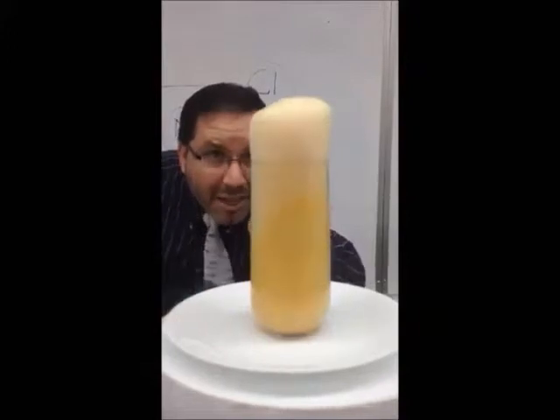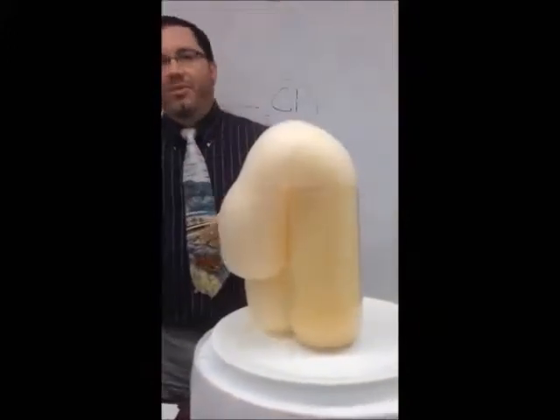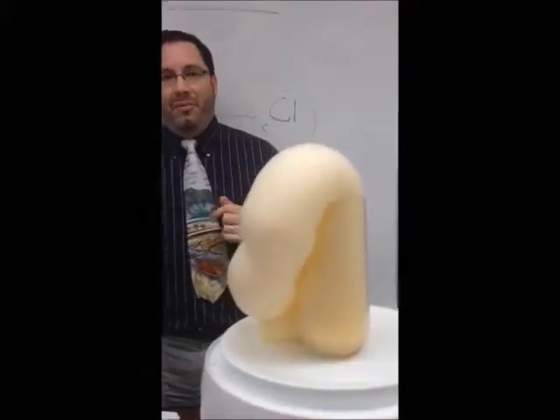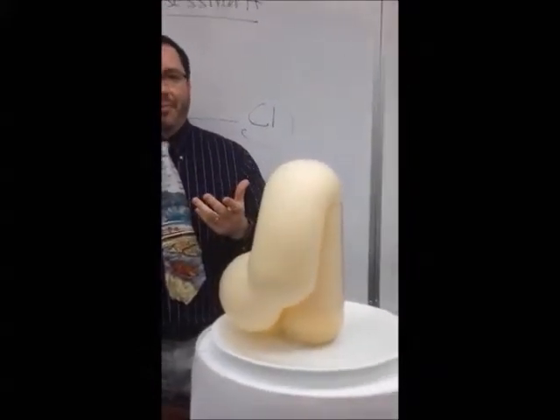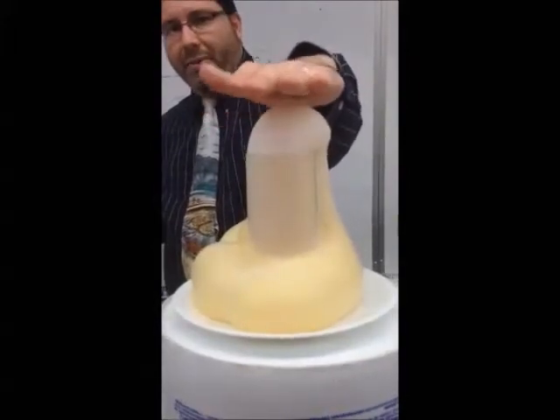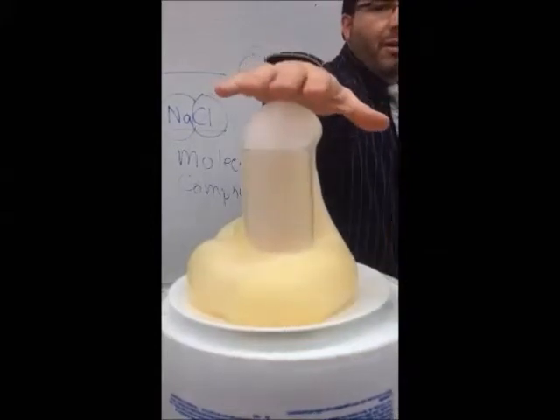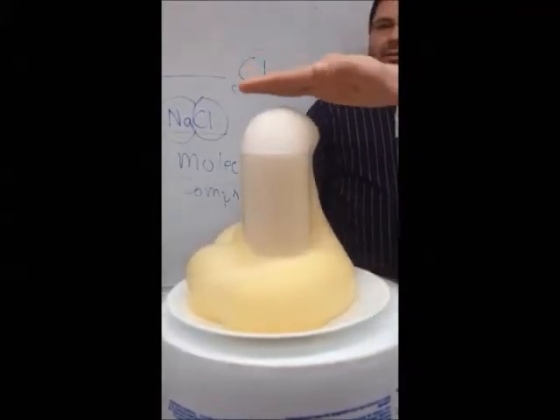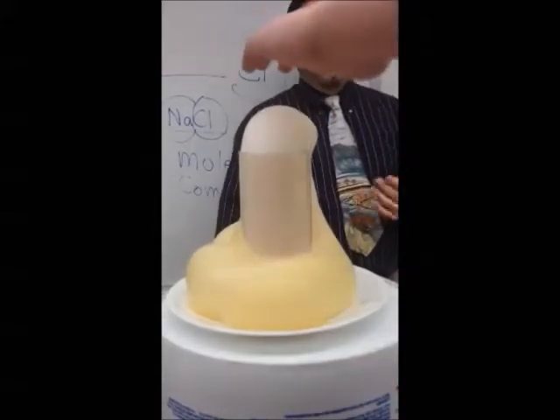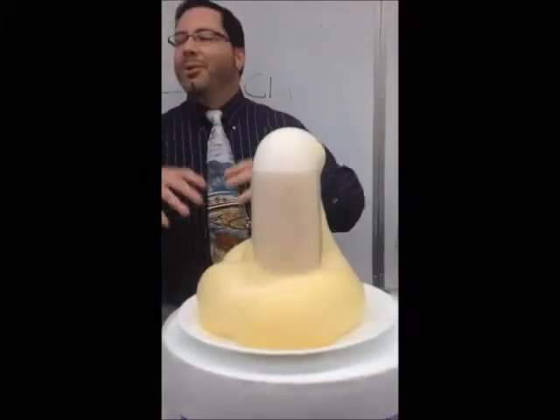At the top, you'll be able to see steam. See steam? Whoa. It is warm. It's very, very warm. To produce steam, it has to be fairly hot. And you can actually, seriously, put your hand there without touching and feel warmth. Go ahead, feel the warmth. Heat rising. So that's exothermic. Exothermic chemical reaction.